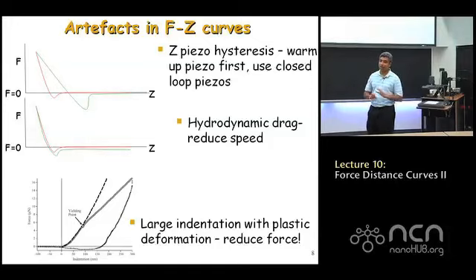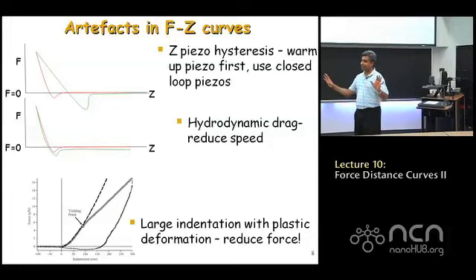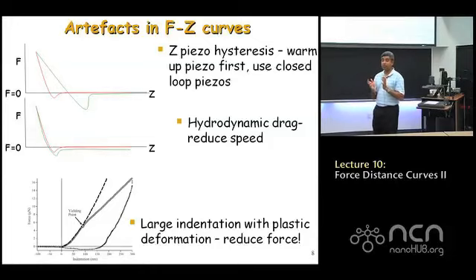Beyond that, all kinds of crazy things start happening. 100 nanonewtons is, for an AFM person, it is hammer. You're doing hammer at that point, right? But people do use it, and if they do it properly, they do get interesting results. But 100 nanonewtons is like absolutely upper limit. You shouldn't be using AFM beyond that. If you're damaging the tip, you're doing all kinds of things.